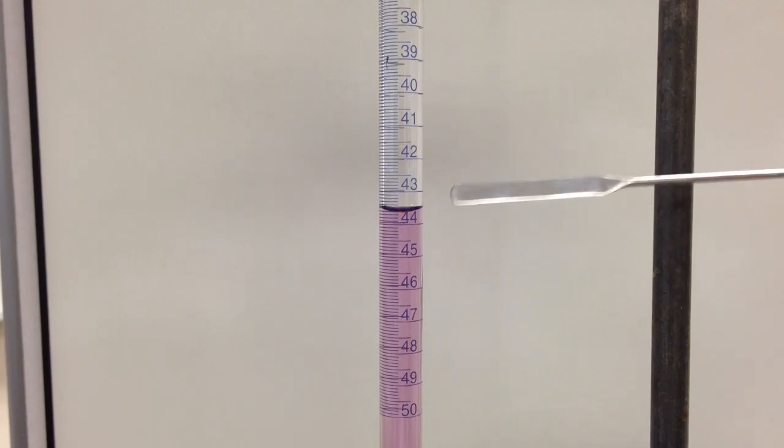Those are our numbered increments, and the next thing we need to do is determine the value of the unnumbered marks. Between 43 and 44 we have 10 marks, so therefore we would say that each unnumbered mark has a value of 0.1 milliliter.